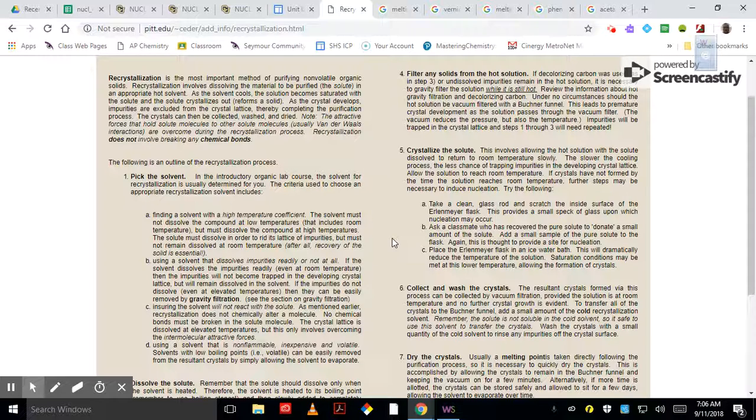But you have to have a situation where the substance that you have is very soluble in the hot solvent, but does not dissolve at low temperature in that solvent. And amazingly, this happens with many solvents and many chemicals. So obviously here in the beginning, we'll pick the solvent for you. In future, you have to make a decision on the solvent. A lot of times you have to take some of your material and see if it dissolves in a small amount of cold solvent.